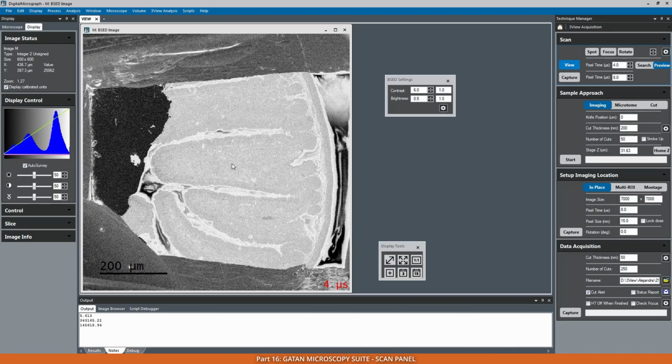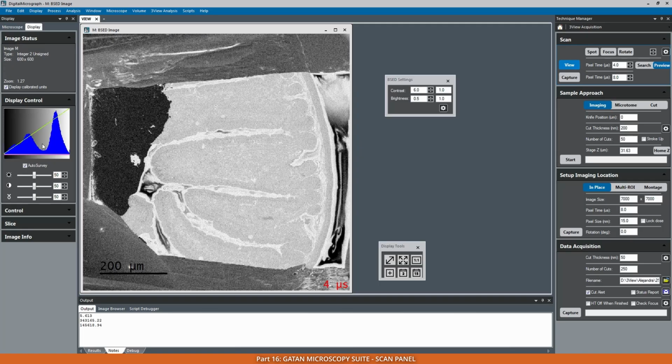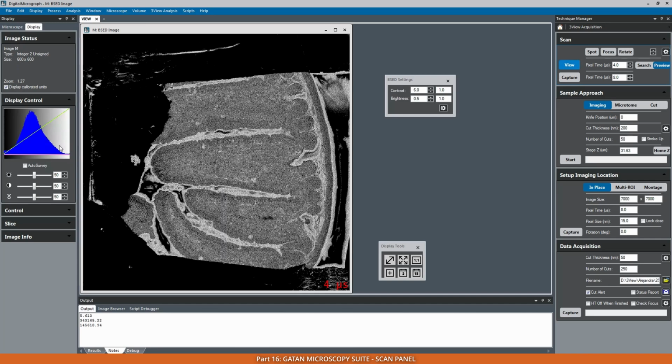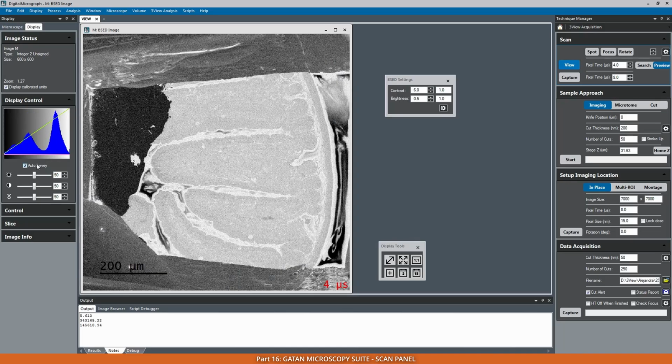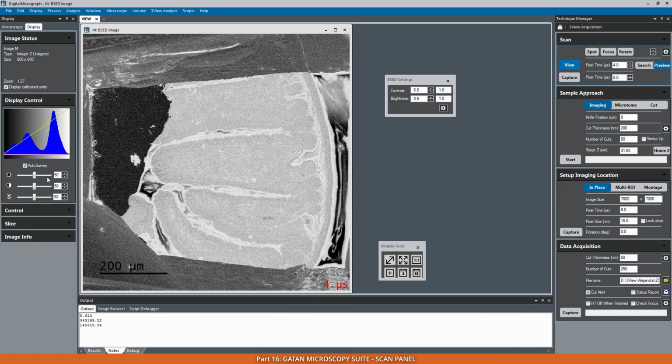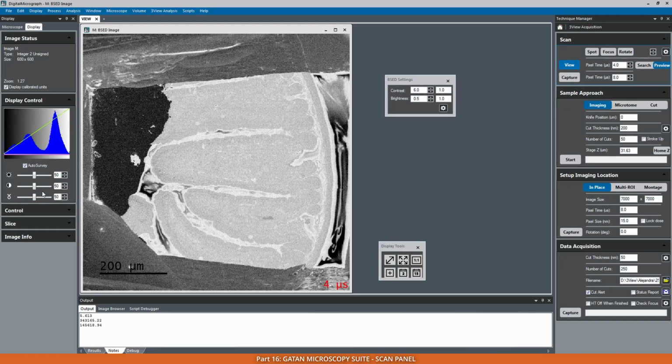But if your contrast is not good for some reason, you can actually hold the left mouse button and select an area. In this case, the contrast will be stretched to these values, and then it won't be auto surveyed. To reset it, you can just double click on this color bar here, or perhaps just press this auto survey button. Let's test this. Yes. This brightness, contrast, and then gamma I do not touch because I don't really see any point of this.